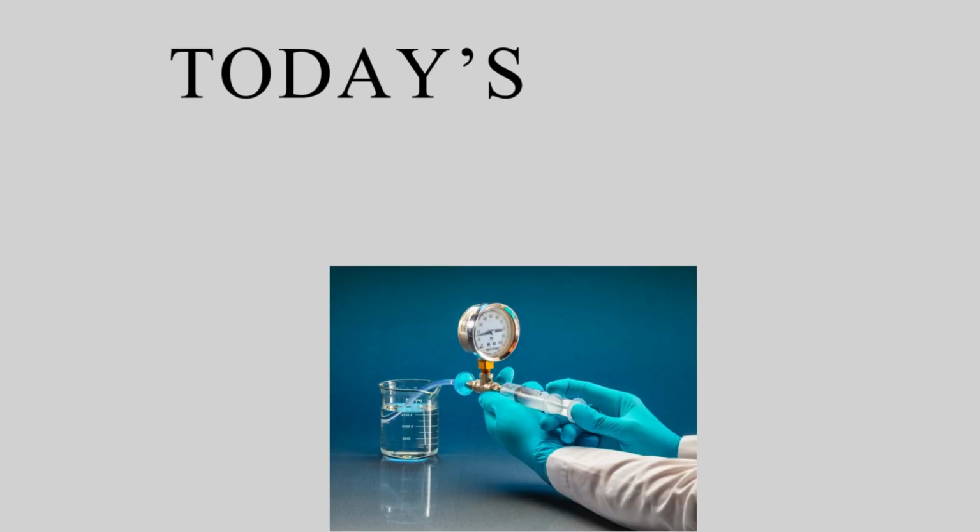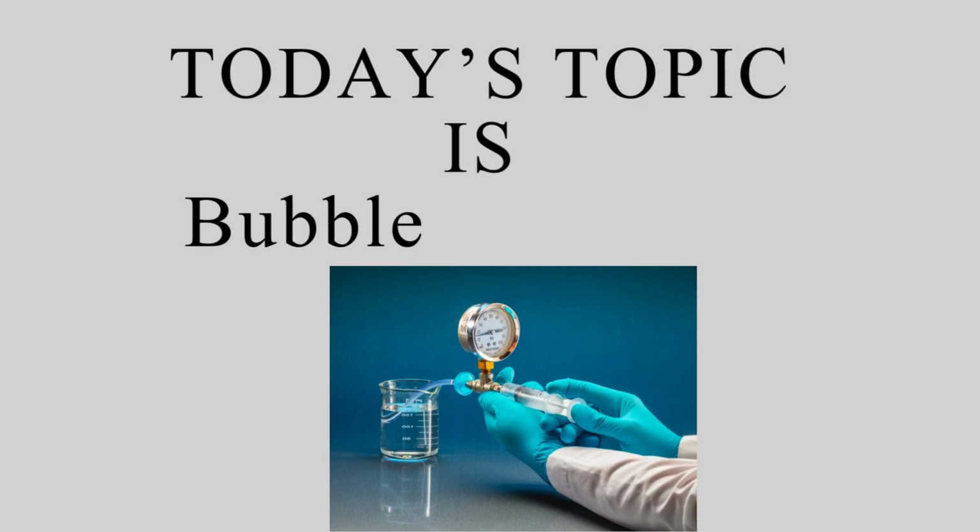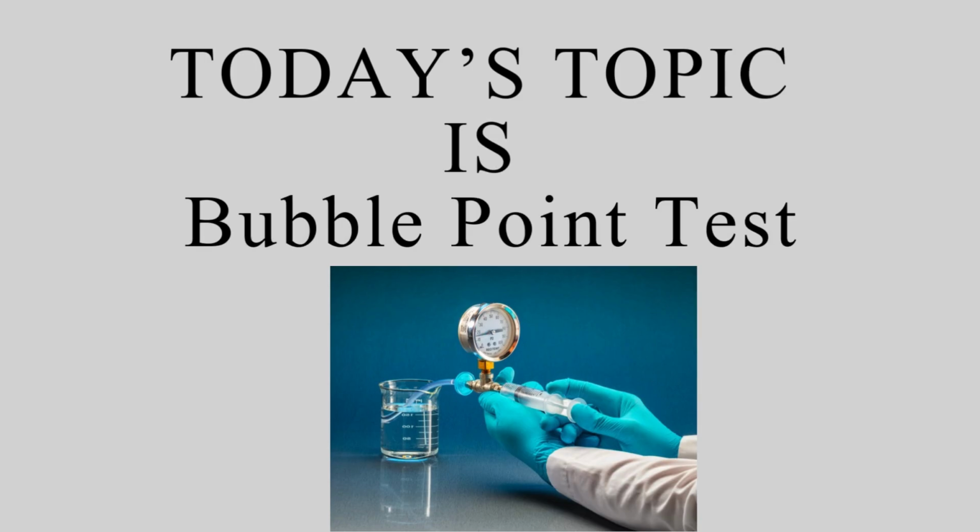Today we're talking about one of the most important concepts in sterile filtration, the bubble point test, also known as BPT. Let's understand it in the simplest and clearest way. What is the bubble point test?